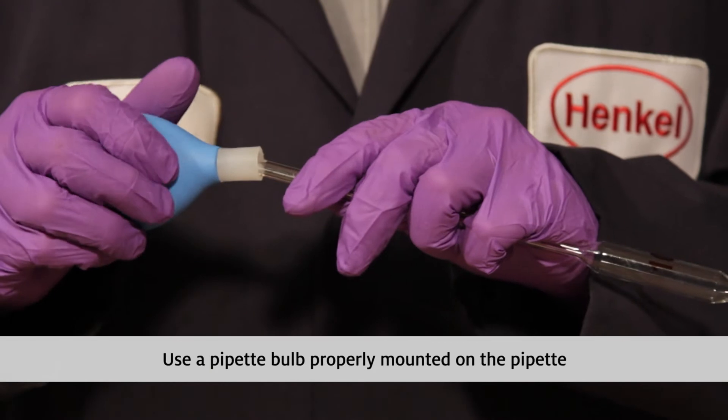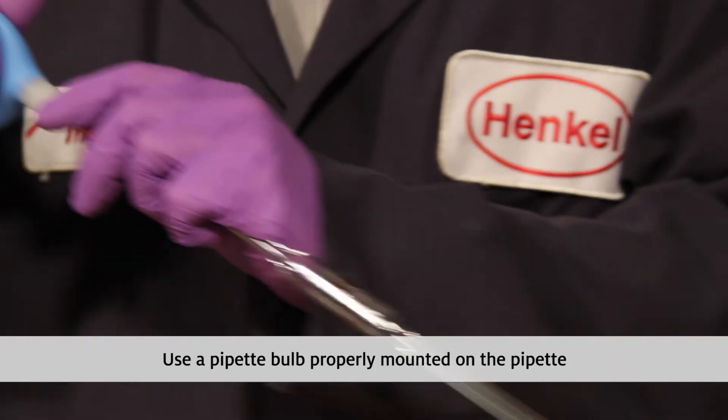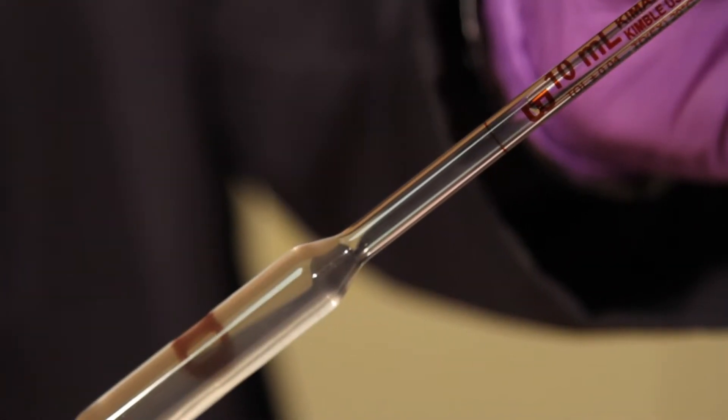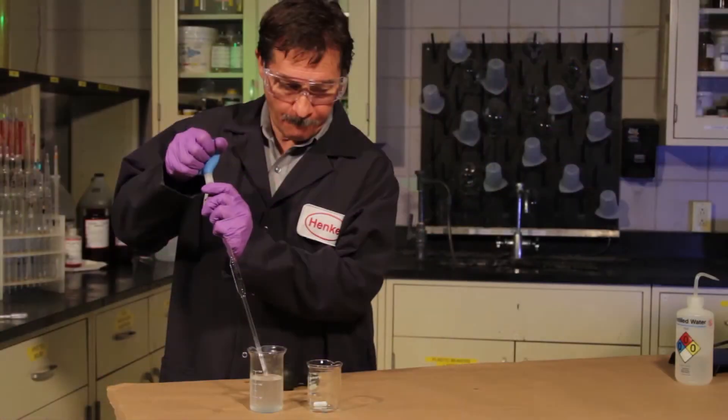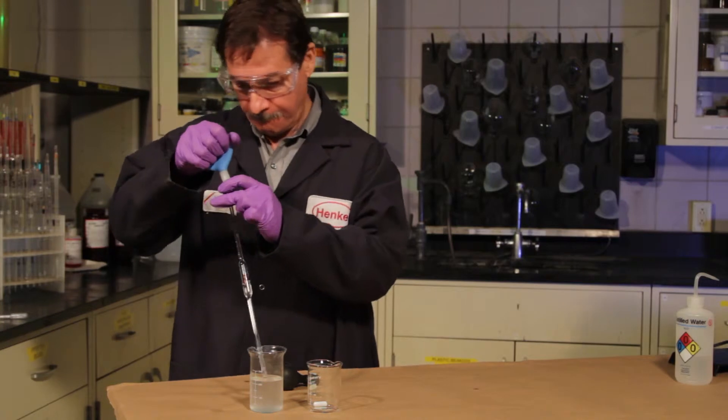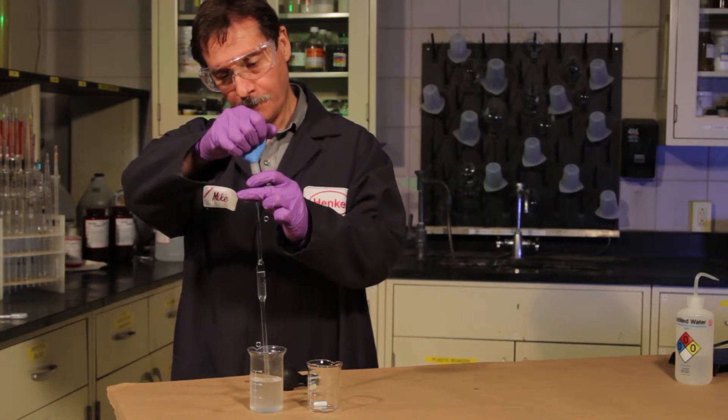Use a pipette bulb, properly mounted on the pipette to draw up the sample. Draw up your sample until the level hits the marked line near the top of the pipette. You may have to do this a few times before you become proficient at getting the level just right.